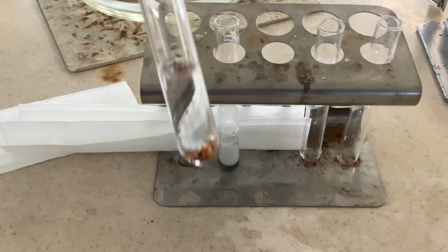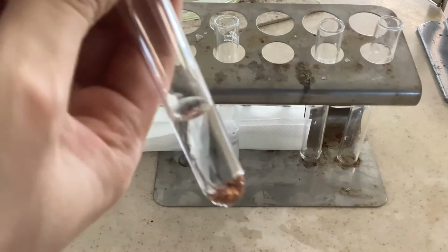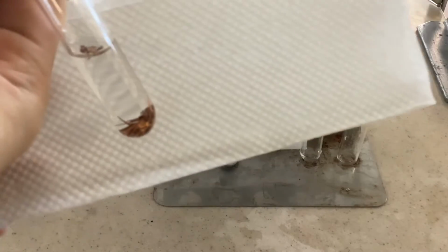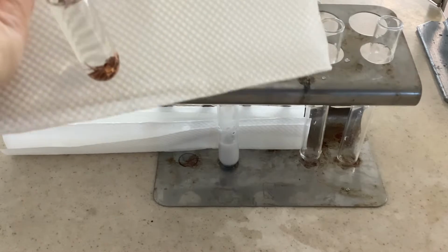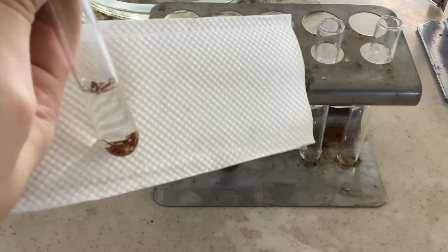And then have a closer look at that in copper. Can you see it? No change at all.